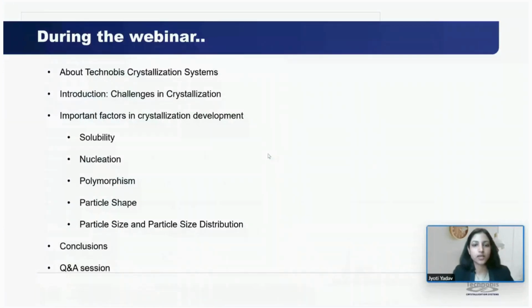During this webinar, I will give a brief introduction about Technobis Crystallization Systems. To give a background introduction to the topic, we will discuss the challenges in crystallization, and then the important factors in crystallization development like solubility, nucleation, polymorphism, particle shape, particle size, and particle size distribution.